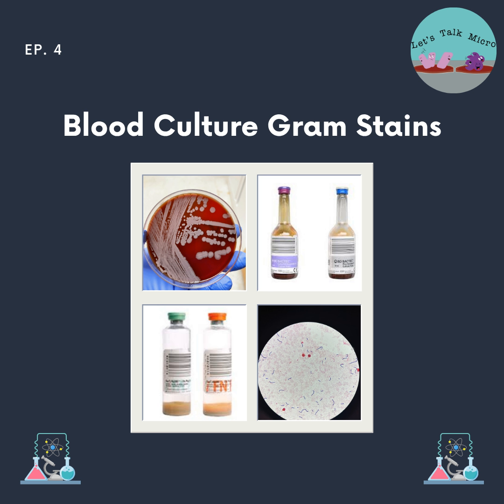However, one difference is that we do not report the PMNs, the white blood cells. I mean, we still use them as an indicator of our stain. Do you remember what they should look like? What they stain as? They stain gram negative. So it's a good indicator. If you have them purple, you might have under decolorized your slide. But if they look pink, that means that the process worked well.